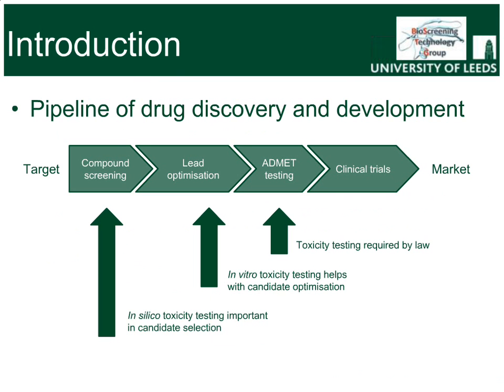In an effort to reduce failure rates, preliminary toxicity testing now frequently occurs earlier in the pipeline, as indicated by the arrows. There is a potential for earlier elimination of toxic compounds in combination with initial compound screening to streamline these processes further. By using in vitro techniques earlier in the process, failure occurs earlier and is more cost-effective.